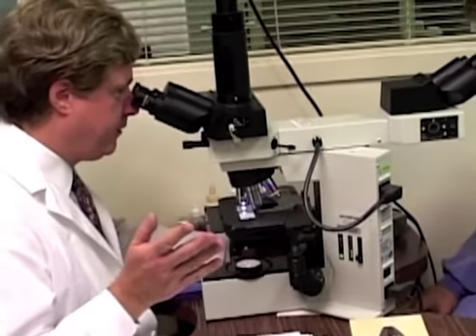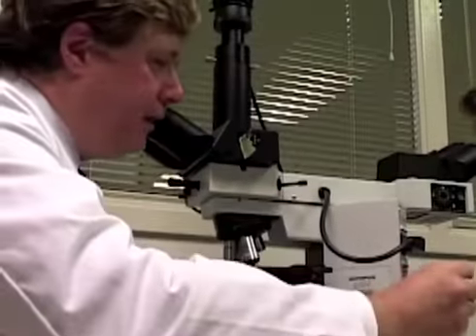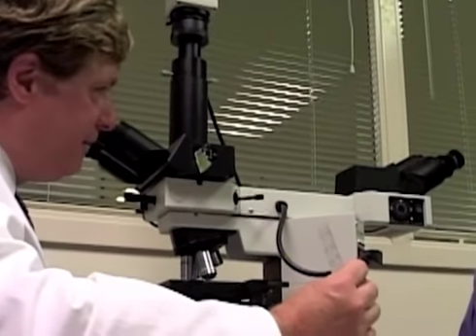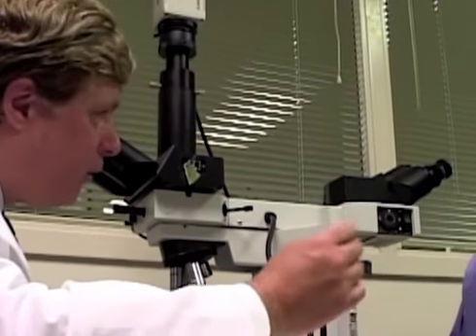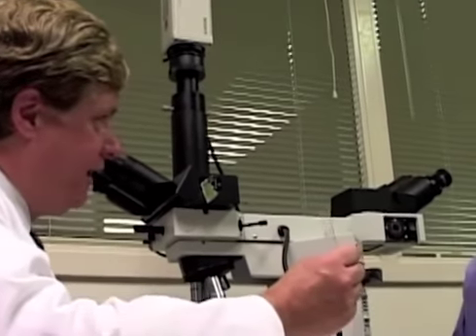This would be a scraping from a woman's cervix. And this here is a different sample. This is a tissue processed in Kerry's lab. Yeah. It's a surgical path tissue biopsy. Right. That then is processed in the wax. Right. And then cut as a thin section and then stained with the pink.